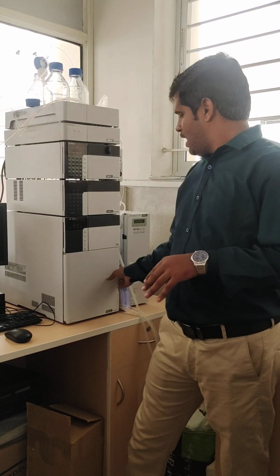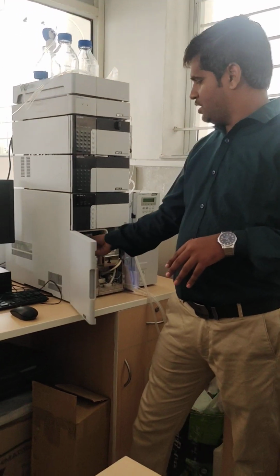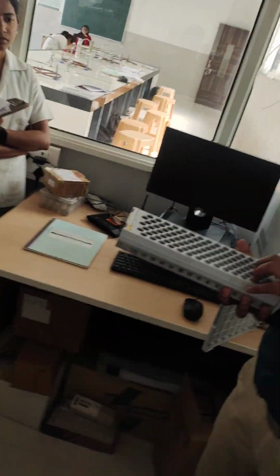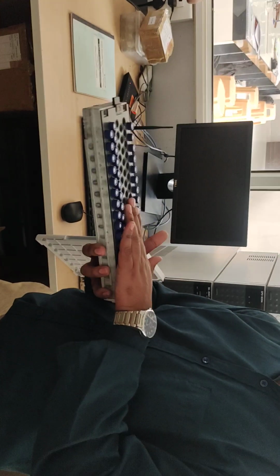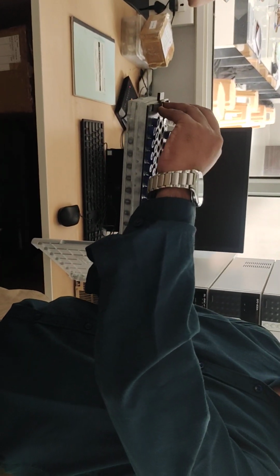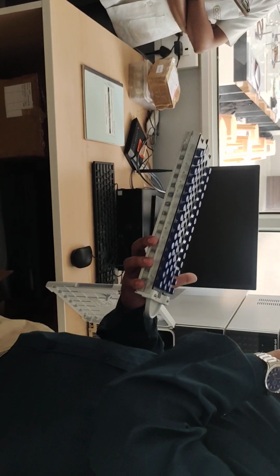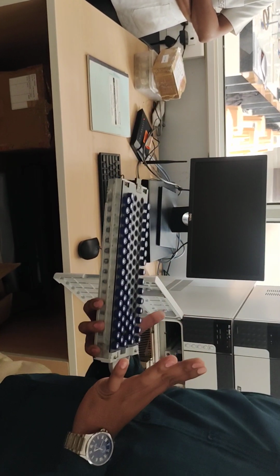Now, one more compartment is available, that is the sample cell. What is that? Sample cell. I will show the sample cell. Just open this sample cell door and we have the rack. Such a type of rack we have, and we can keep more than 100 samples here. Means total sample cell cavities are 105. How many? 105. Total 105 samples we can keep here, and we will analyze them with the help of the autosampler.